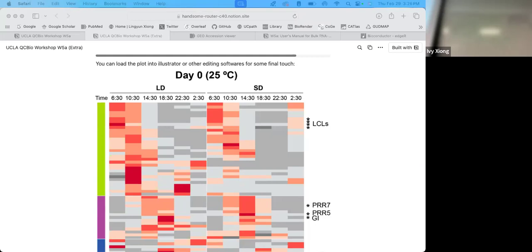Oh, okay, thank you. Then you can scroll down to M and look at MTX. Yeah, it's like a number. So I've got here 1 to 79. The main line is not the best to work on because I managed to scroll through.